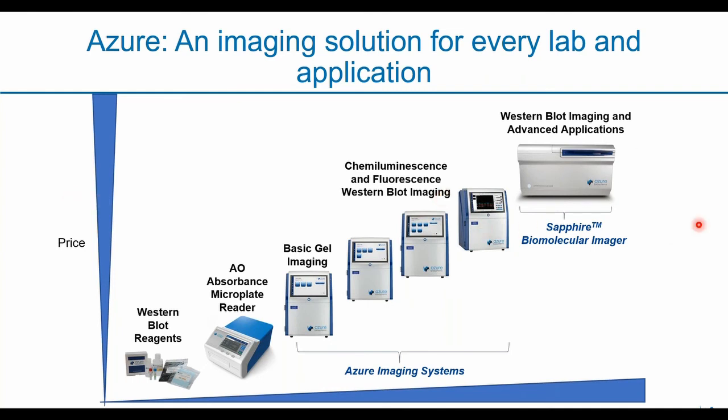Let me put up the question tab again. So not all of them have fluorescence detection; it is based on the model. Normally models 400, 500 and 600 will have the fluorescence module.